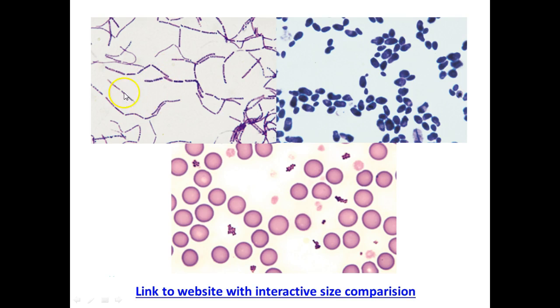This is bacteria that are rod-shaped. That's about as detailed as we'll get under our microscopes. Here's some yeast. They're a little bit bigger. They're eukaryotic. We'll look at them next week. Here's some red blood cells and someone with a staph infection in their blood. These are actually bacteria, little clusters of tiny cocci bacteria. In lab, this is as exciting as it gets, except you'll color them, you'll make them pretty, you'll have fun with them.